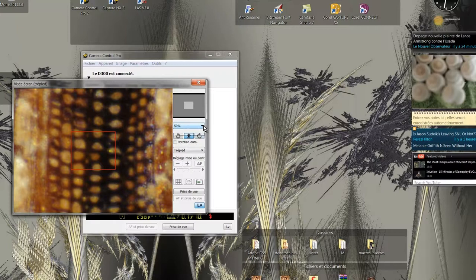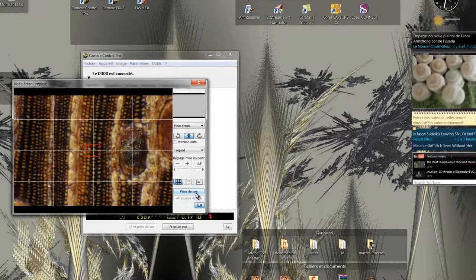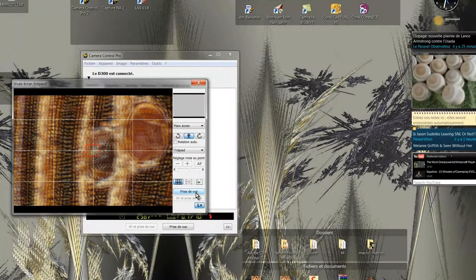I return to normal magnification of the camera and I choose the location of the picture I want to take. Now I take the photo.